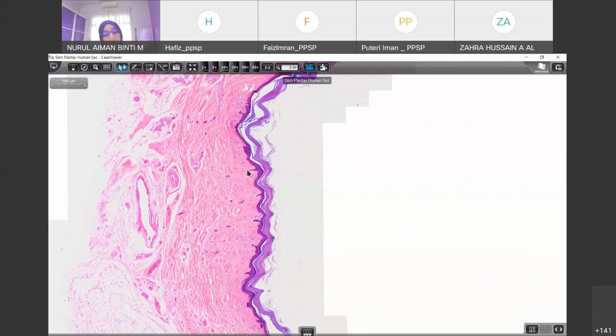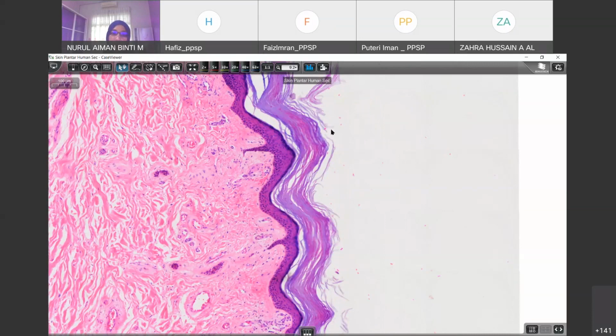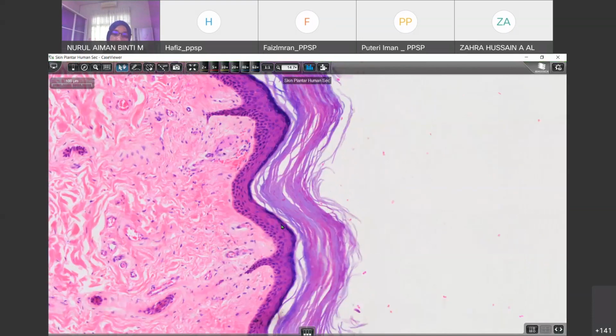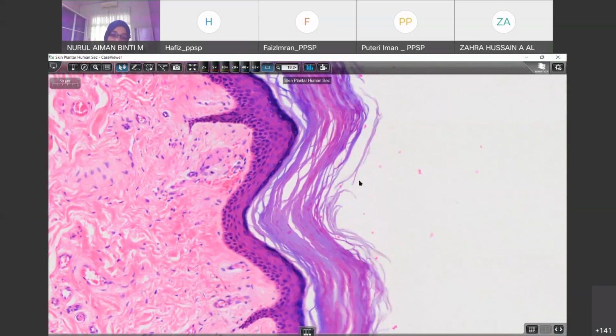Even your sole has a very hard surface. That area might contain a lot of keratin. Keratin can withstand friction and erosion, not erosion from chemicals of course, but still it is a very tough structure without nucleus.